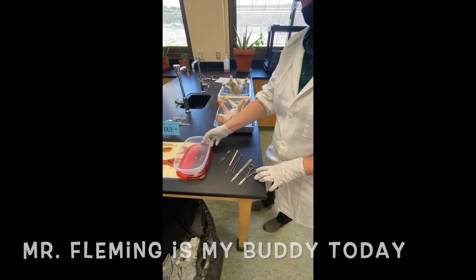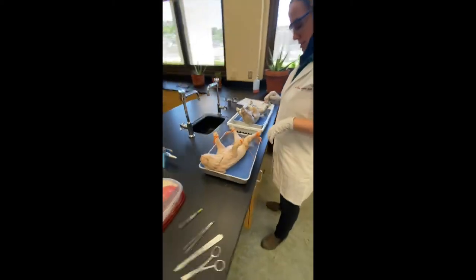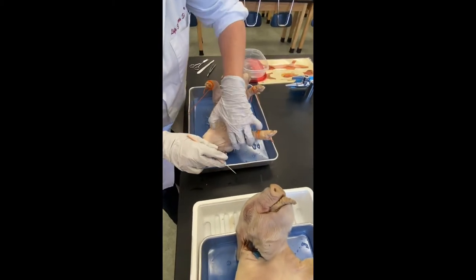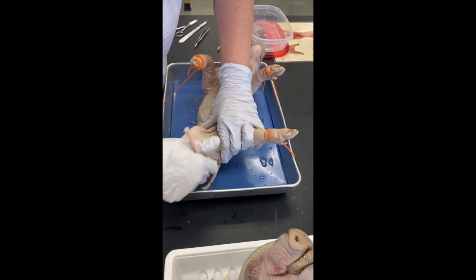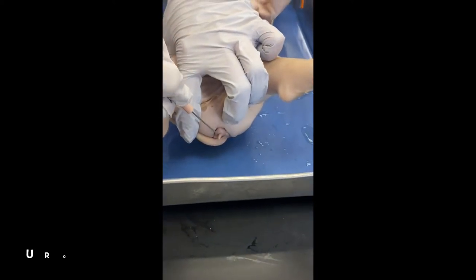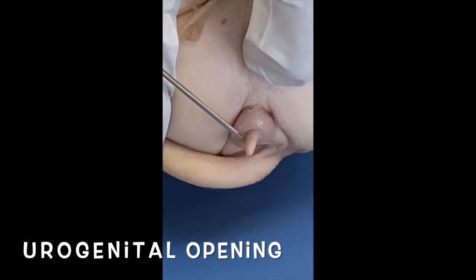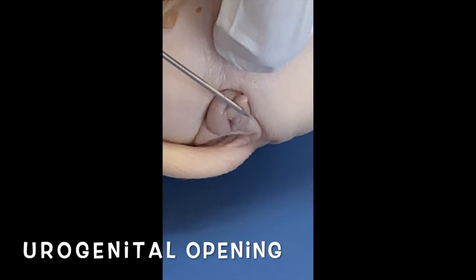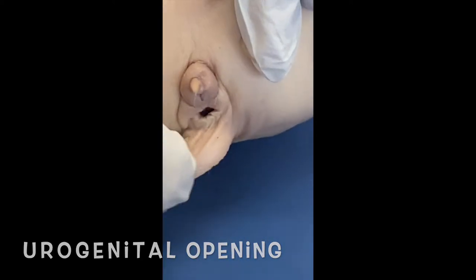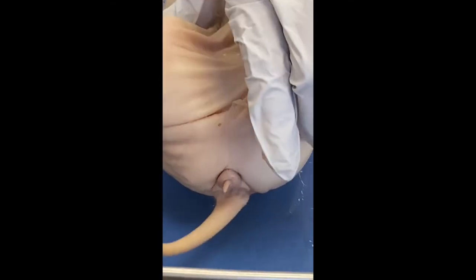I'm going to move into the pigs at this point. I'm going to pick up my little pointer. Here we have a female, so we're going to start with how we know it's a female. At the very back, pull the tail back. This is the urogenital opening. If you pull this back, this is the urogenital papilla, a flap that covers the opening to the female, the urogenital opening. If you look at her, you can see that looks very different than what we would see on our male.